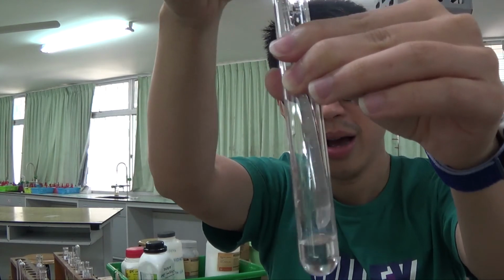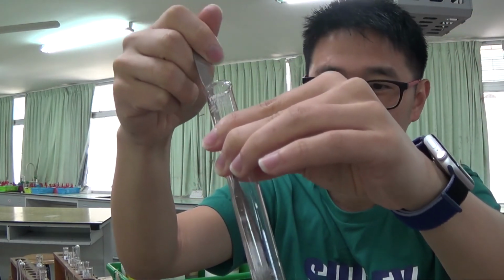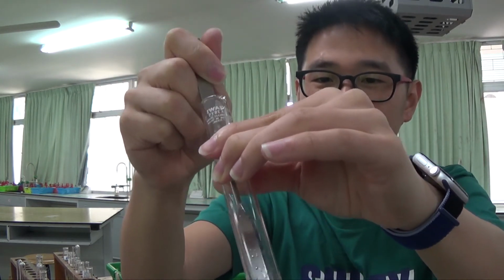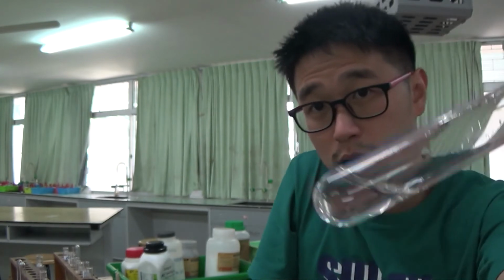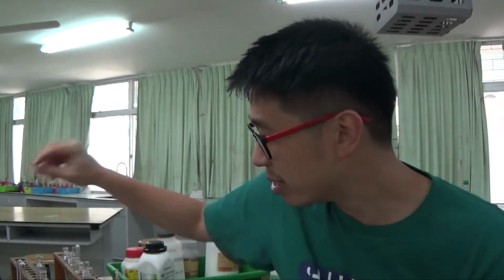So when you have a hydrated compound, when you are provided the solution, it does not matter anymore because the water of crystallization will have just become part of the distilled water or the deionized water that makes up the solution. You saw the solid just now was kind of pink, right? But the solution looks really colorless. Even against the white background, it looks colorless. It was manganese chloride.